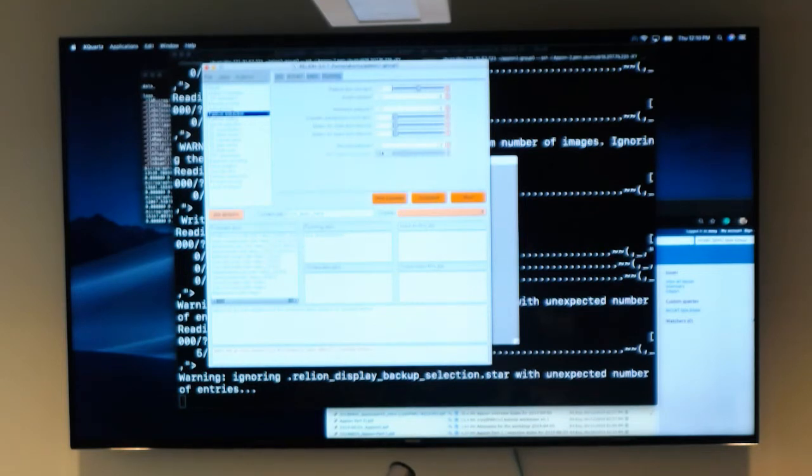So then what do you do? Well, hopefully you can design your experiment where it's not all or nothing, and that you're not after something that's only 1% or a fraction of a percent within your sample. Because then you'll really have to push your data to see that. That's a very hard position to be in. So hopefully you're working on novel proteins that you have worked out biochemistry for, and it won't be so severe in terms of a research project.